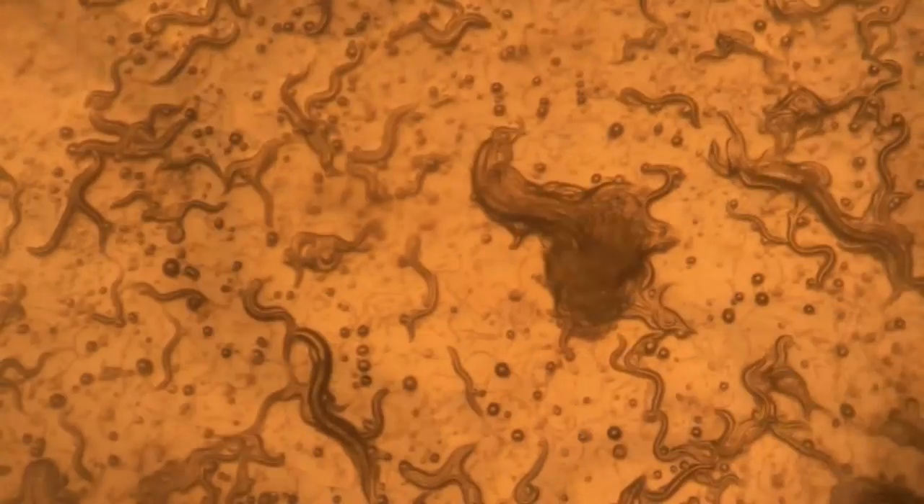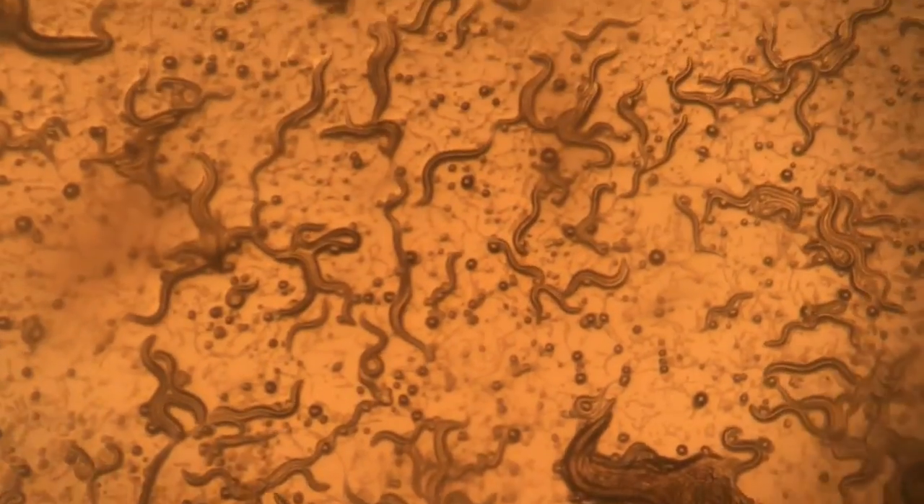Here is the L4 C. elegans, the largest you will see. It is separated from the adult C. elegans due to the absence of eggs within the stomach.